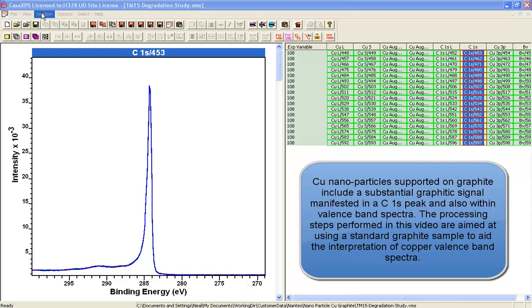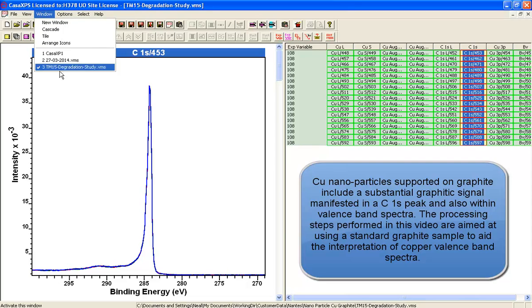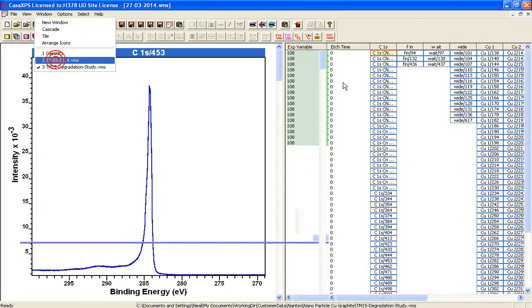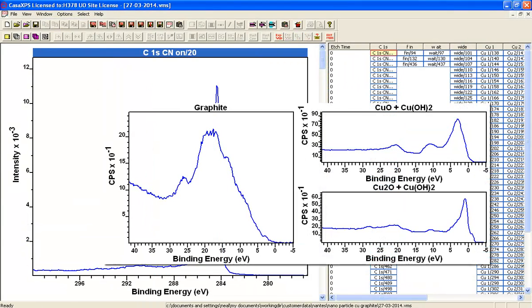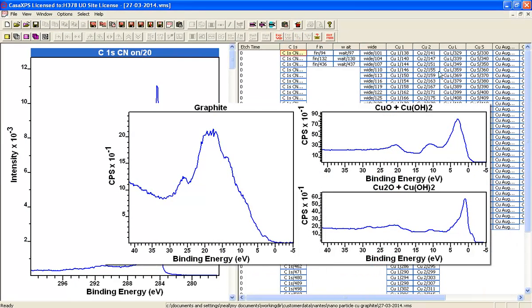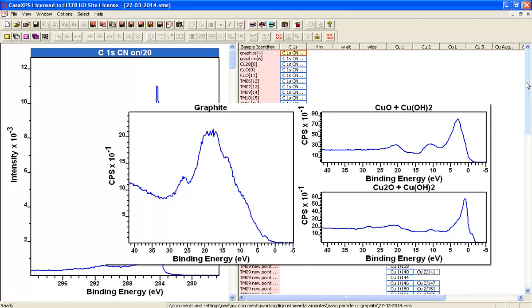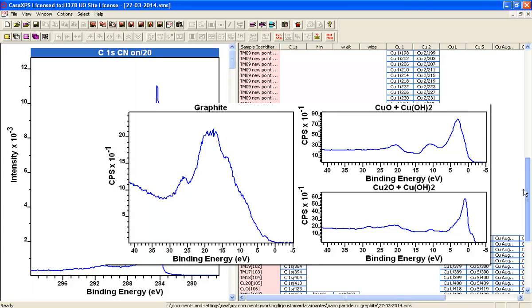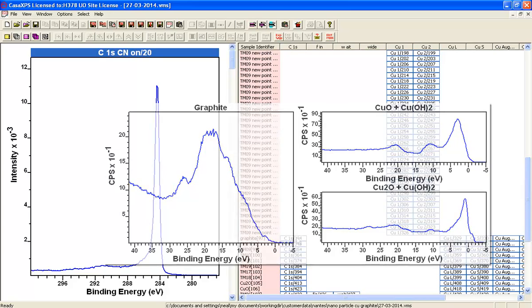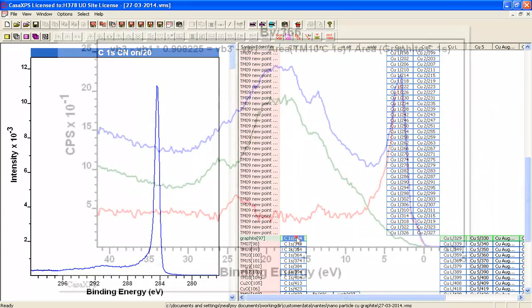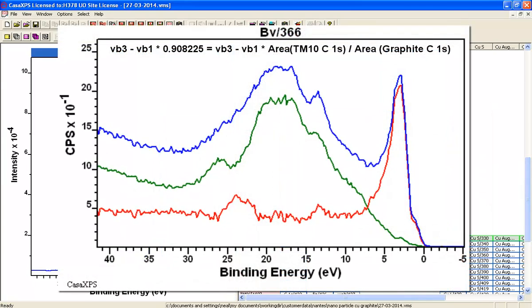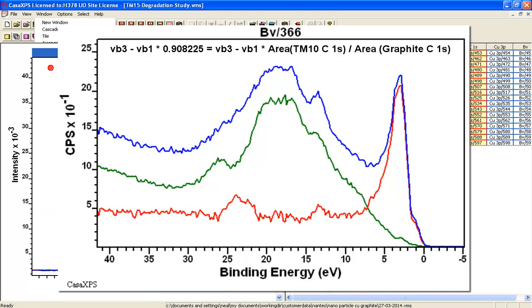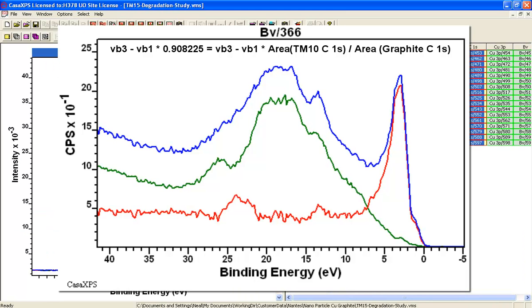We're going to look at the valence band from these copper nanoparticles. Since the valence band spectra will include a signal from the graphitic part of this material, the first job is to work out how to subtract from the valence band spectra an appropriate valence band spectrum from graphite.